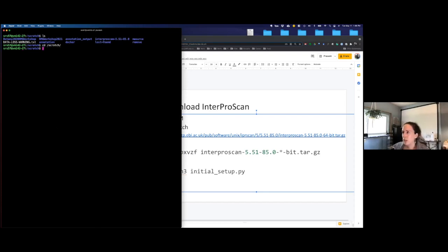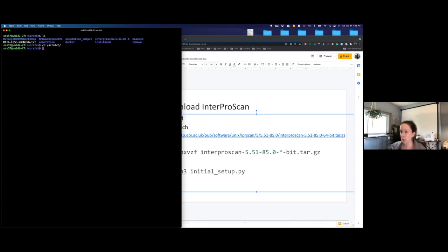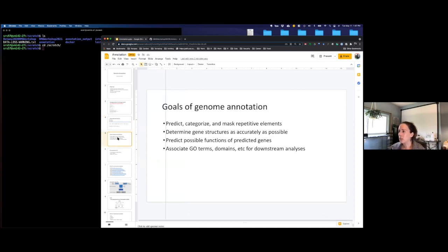And just for anyone that's curious, I'm using Hyper, which is basically a terminal, instead of using the web SSH, just because the copy and paste thing was driving me insane. You might have noticed that you can actually get an IP address for the image that we're using. So you could just do SSH and then that IP address and use a terminal instead of something that might be annoying for you, or maybe it's not.